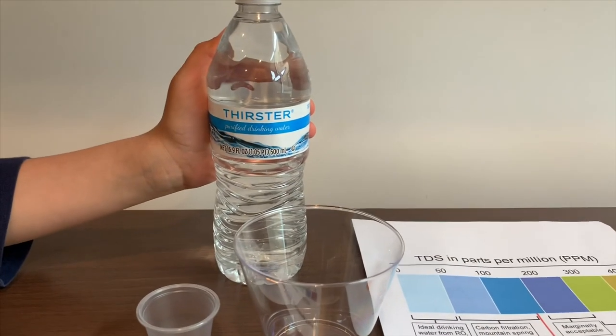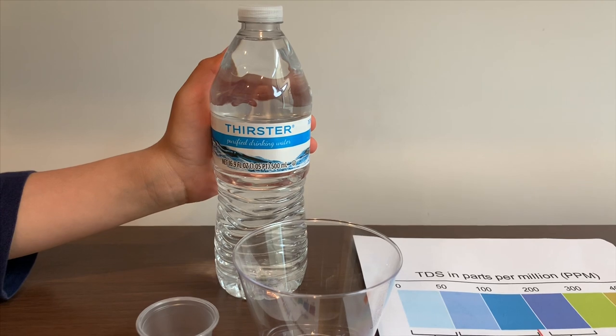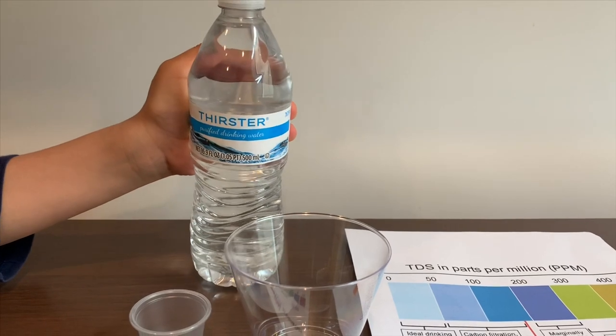This is Thirster Purified Drinking Water. It's also produced by Niagara, and we bought it from a coffee shop — it cost $2. Let's test the pH and TDS level.